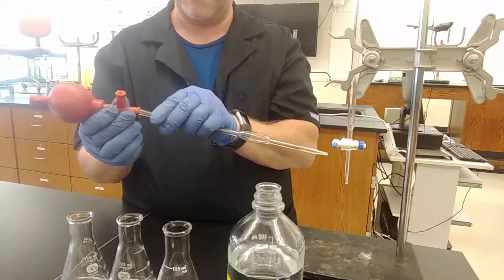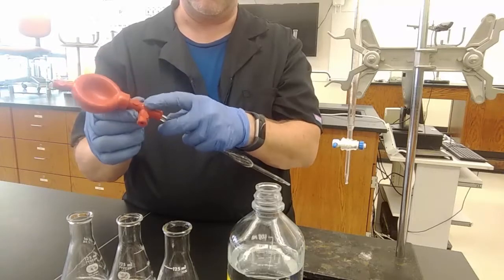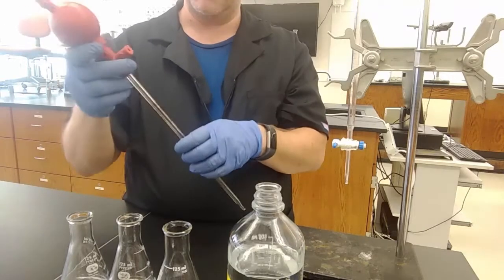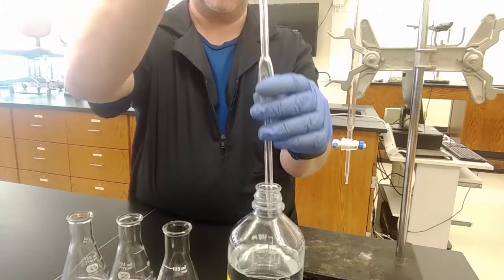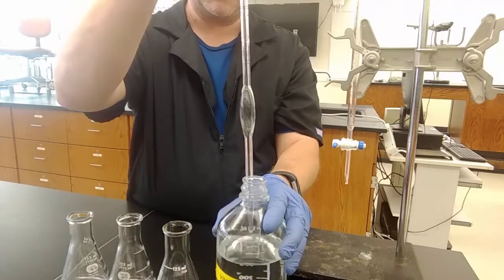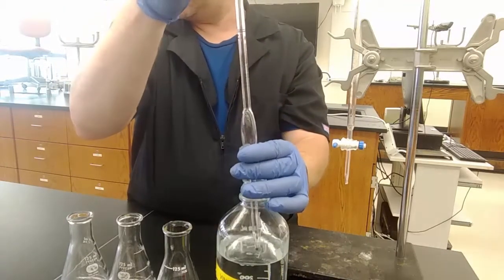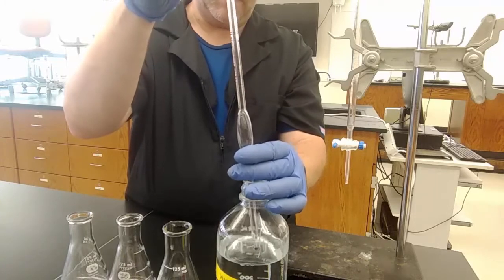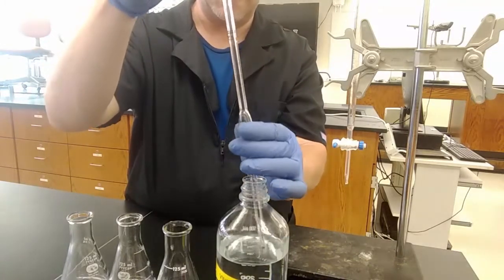So you want to put this on gently, because if you shove it in there, you'll blow the valve to pieces. There's a little ball bearing in there. And we know that our pipette is clean, and so that's the only reason that we can go directly into our stock solution bottle. We would not want to contaminate this bottle. So the reason that it says pour around 30 milliliters of acid into a 100 milliliter beaker is because we don't want this bottle contaminated. I am not contaminating it. I know that my pipette is clean.